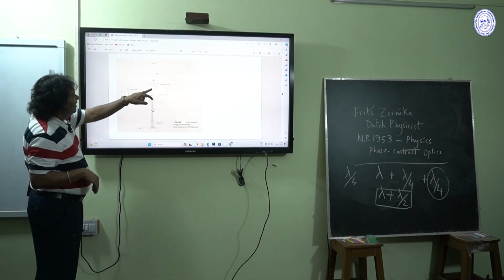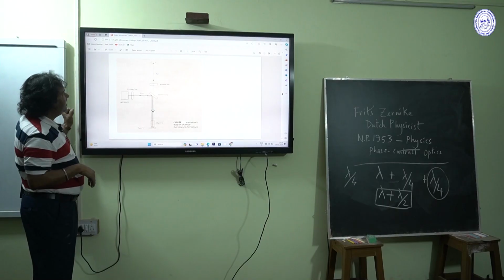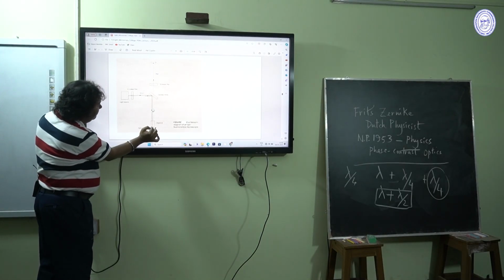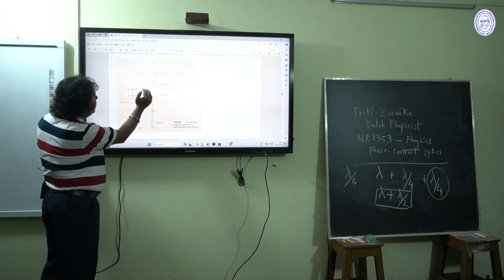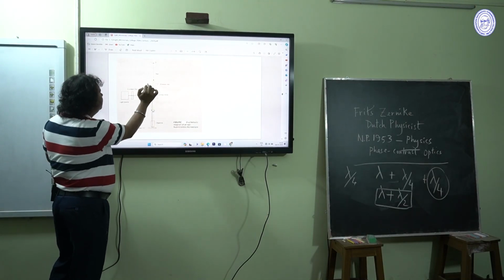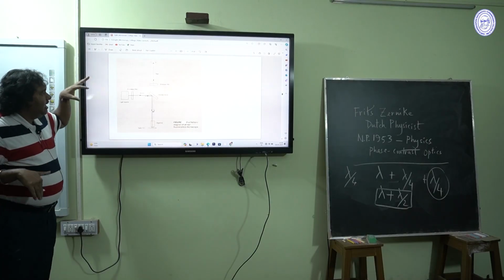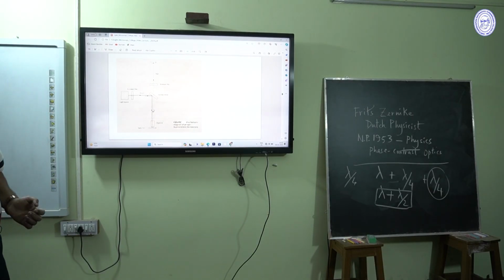After that, there is an emission filter here. The light that is emitted is red in color, and this passes through the emission filter and goes to the observer's eye. This is the basic working pathway of the fluorescent microscope.